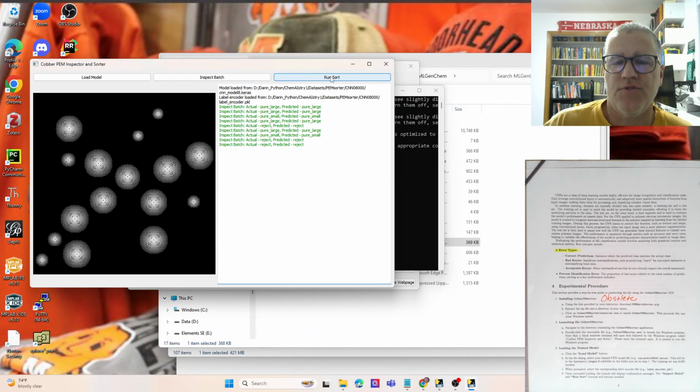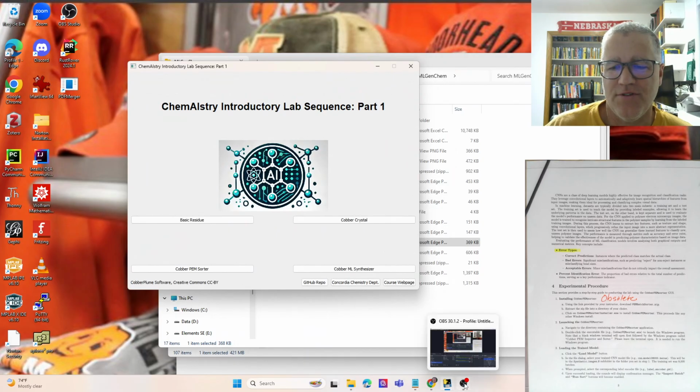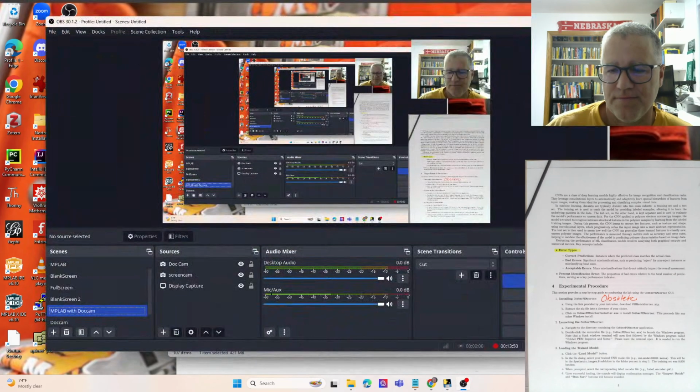So I'm going to run this 200 runs. We'll watch these come in. So you'll watch the screen go, and we'll see how this is doing. Okay, I'm going to pause the video and restart this.